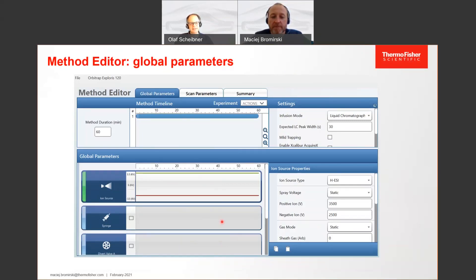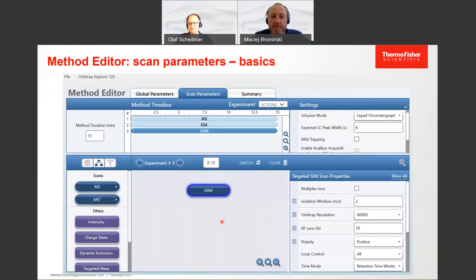On the other hand, you have the scan parameters — this is the MS method, the mass spectrometry method. On the Exploris 120, you will be able to line up three different experiments. As an example here: one full scan, coupled with a DIA experiment, and on top of it a targeted SIM. You can give these time windows, so you don't need to run them over the whole time — you can limit the time windows and run the SIM only at a certain time point.